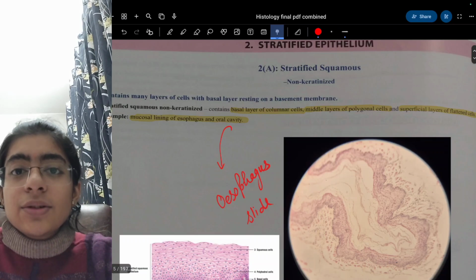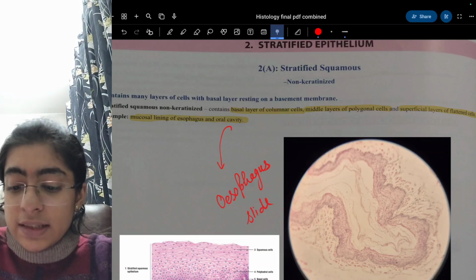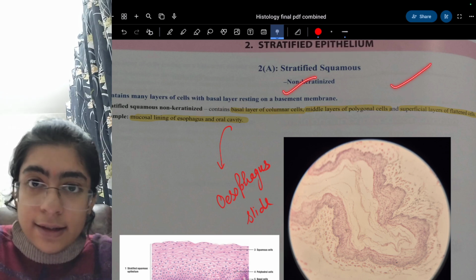Hello everyone, this is Shruti Ahuja, and in this video we are going to talk about part 2 of histology, that is stratified epithelium, the non-keratinized and keratinized parts.